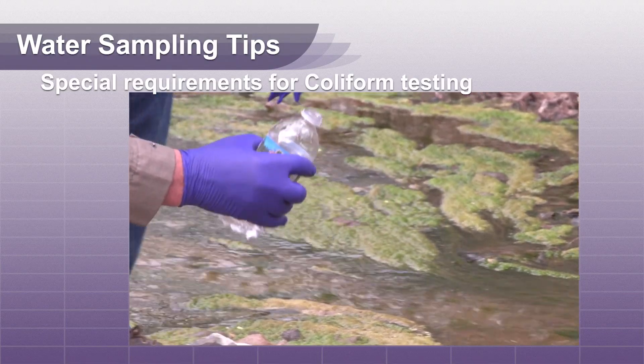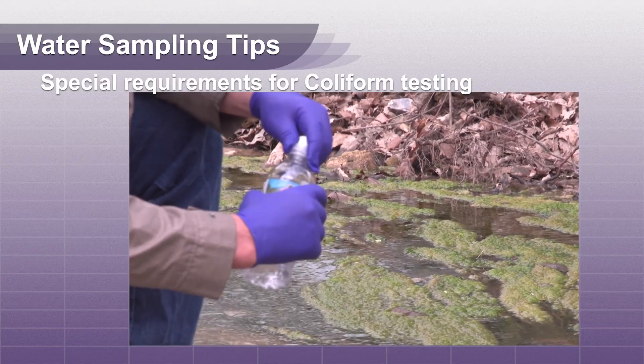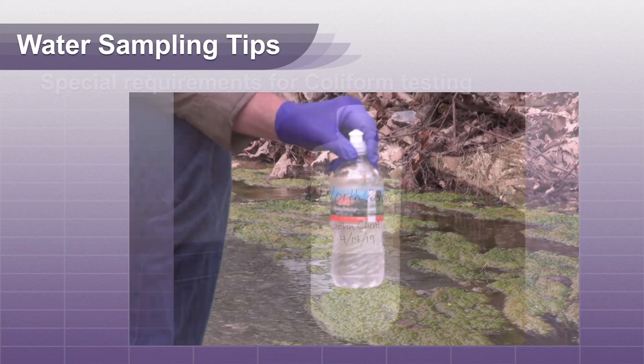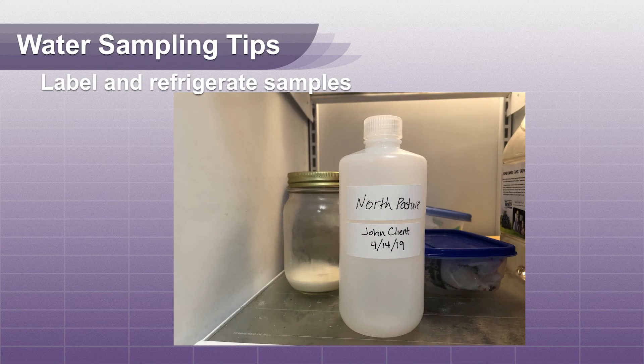Remember, if you are requesting coliform testing, the sample container must be sterile and the sample needs to be delivered to the lab within the same day it was collected. Label your container with location, owner's name, and date. Refrigerate your sample after collection and for transport to the lab.